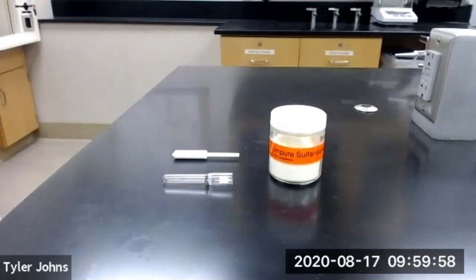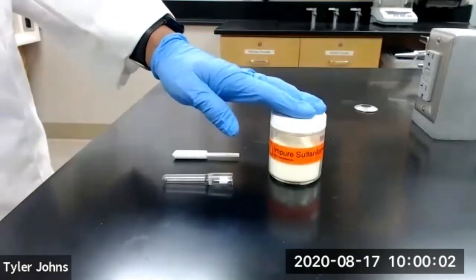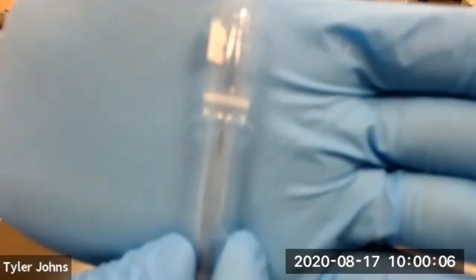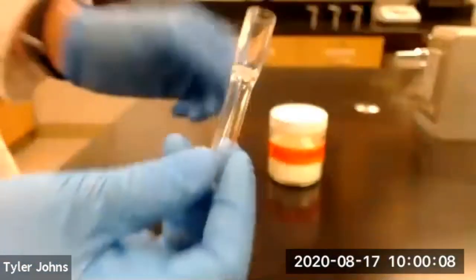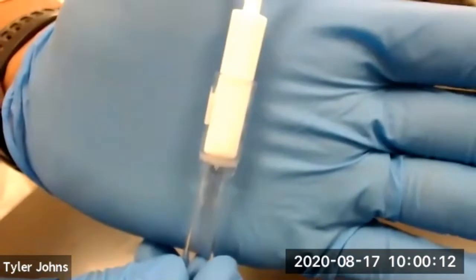In part B of this experiment, we'll be performing a microscale crystallization of our impure sulfanilamide using a Craig tube. This is our Craig tube, and this is our Craig tube plunger. It inserts into the top of the Craig tube like so.